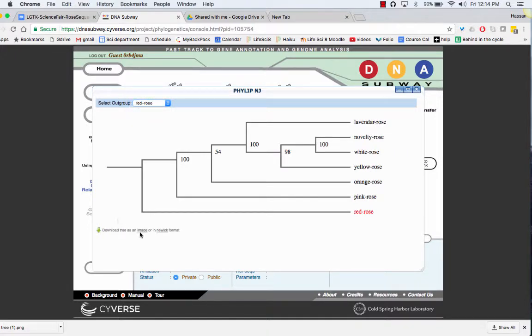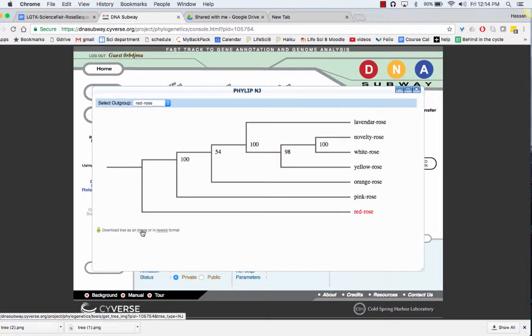You can download it as an image or you can take a screenshot of your cladogram. Hope that was helpful. Thank you.